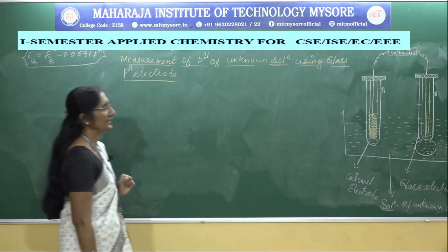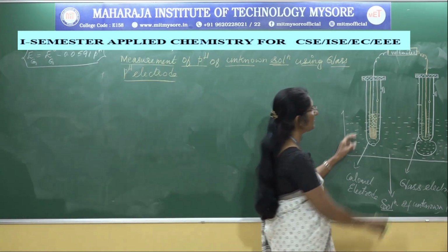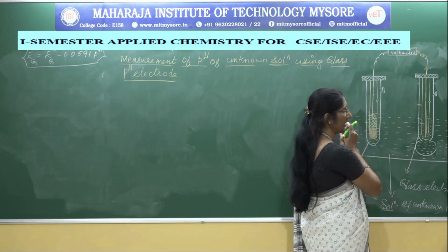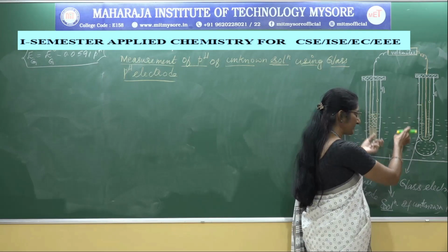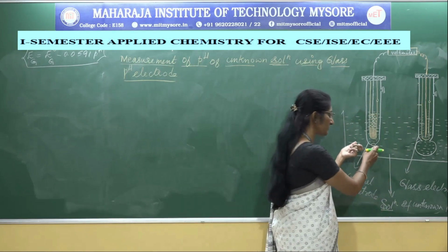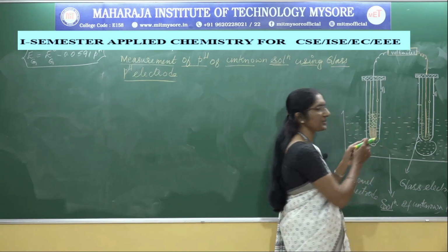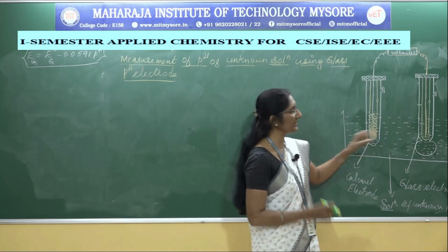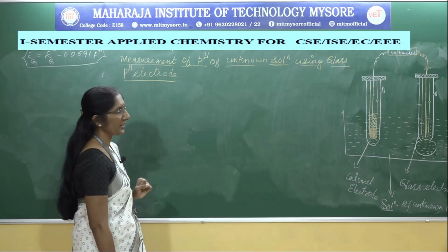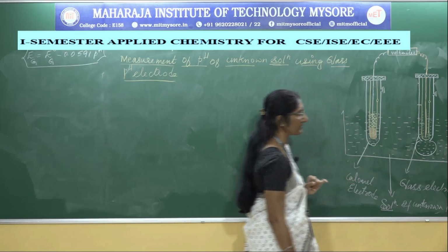Then how is this galvanic cell represented? Observe the diagram. According to this diagram, the glass electrode is coupled with a saturated calomel electrode. Then this galvanic cell assembly is dipped in a solution of unknown pH, also known as a test solution. We have to find out the pH of this test solution by using this galvanic cell. Then how to represent this galvanic cell? According to the diagram, the calomel electrode acts as an anode and the glass electrode acts as a cathode.